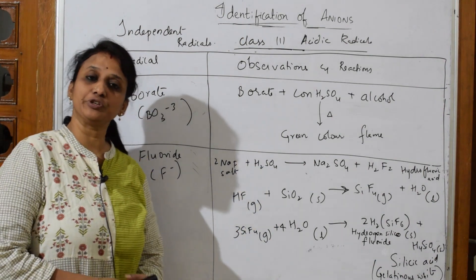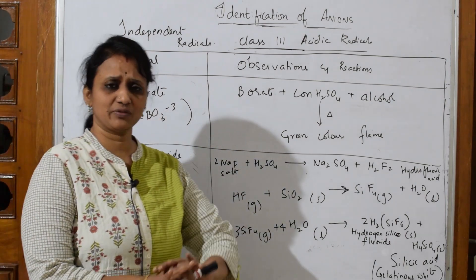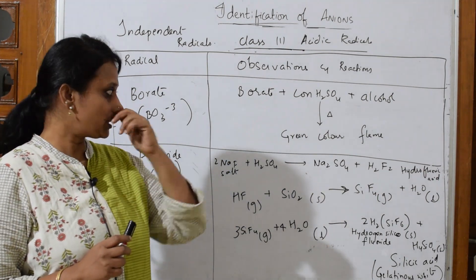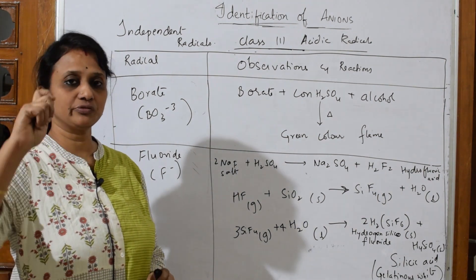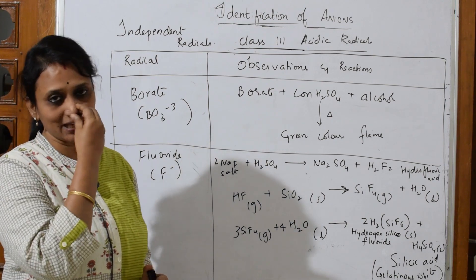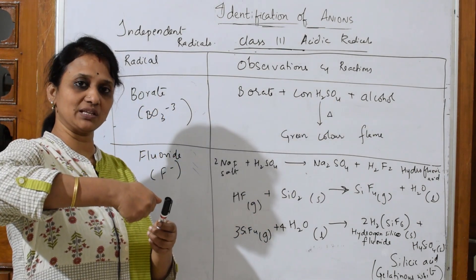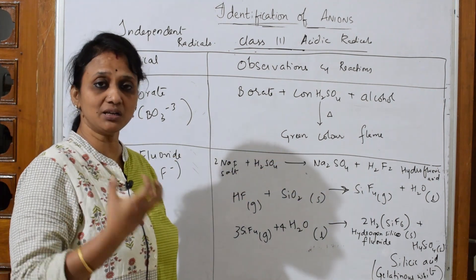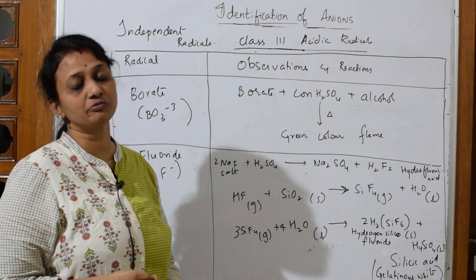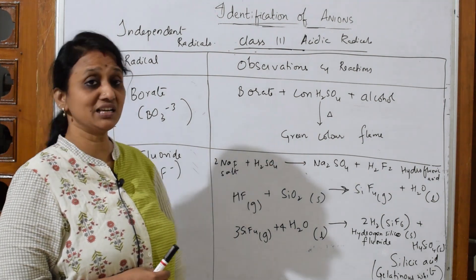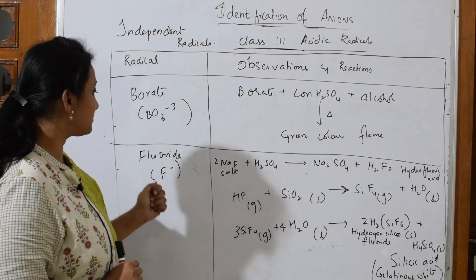Now let's finish the last two independent radicals — borate and fluoride. To test for borate: take the salt given, add concentrated sulfuric acid, then add alcohol — which is a combination of ethanol and methanol as denatured alcohol. Hold the test tube in a slanting way on the Bunsen burner. Immediately the whole thing catches a green color flame. The green color flame confirms the presence of borate in the given salt — it's a very nice, beautiful color flame.